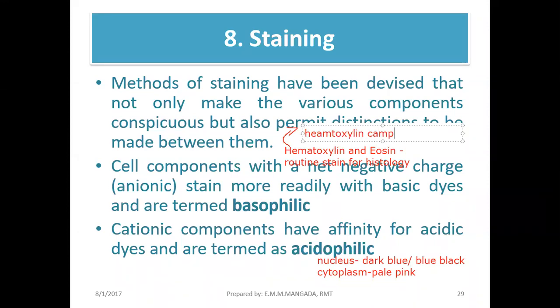Hematoxylin, that's the hematoxylin. Sometimes you see hematoxylin spelled H-A-E, so it depends on the author. Hematoxylin campechianum is the name of the tree from which hematoxylin is derived. So it's an example of a natural dye.